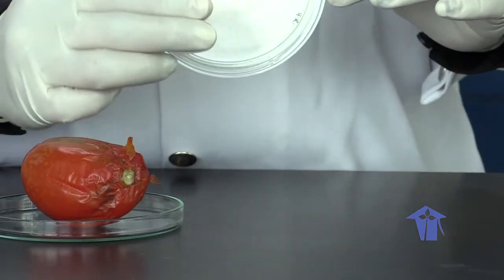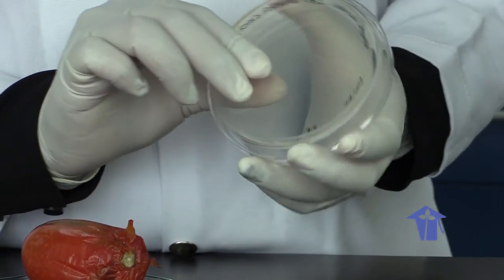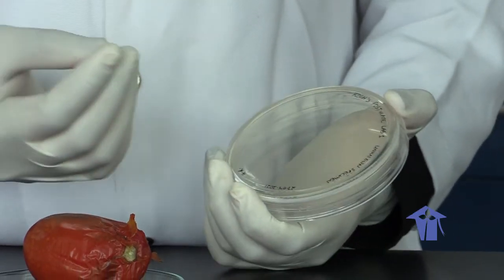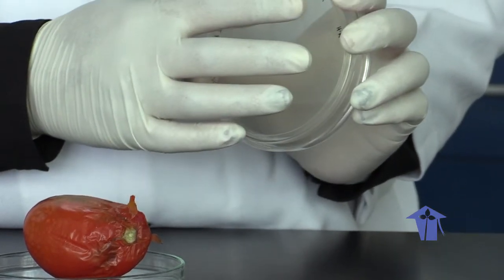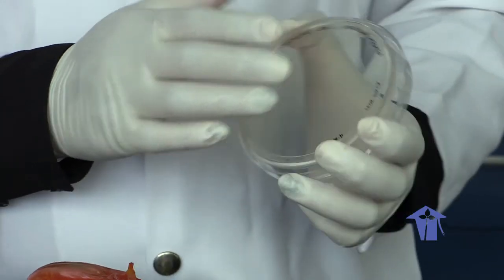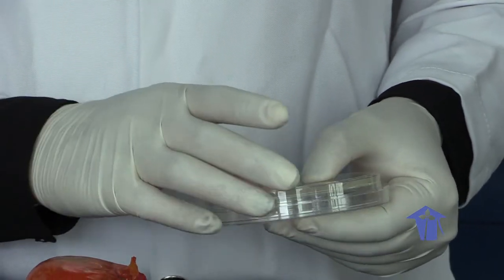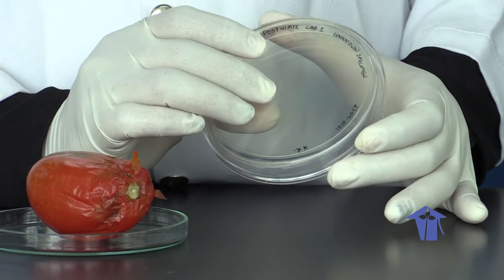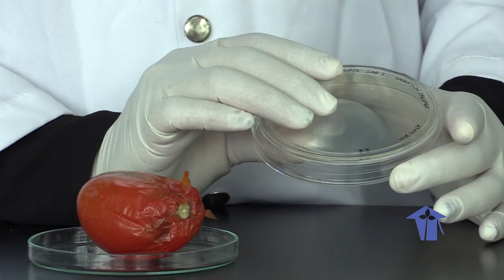We would have further isolated our specimen and did a quadrant streak on a nutrient agar plate. Remember, you must label your plates according to what information you are given for this lab. So this would be our Koch's Postulates Lab 1. It's an unknown specimen. You date it so that you'll know that you're incubating it for what period of time, whether it's 48 hours, 72 hours, and so on. And you also put your name on it so you can identify it from those that your classmates would have done. And this will be incubated for 3 days to look for growth of pure cultures or pure isolates, which are going to be used in part 2 of your lab.